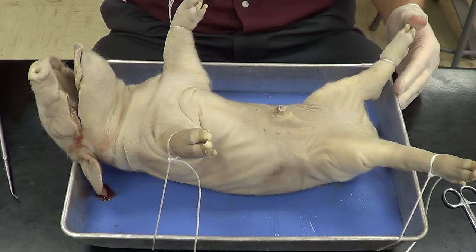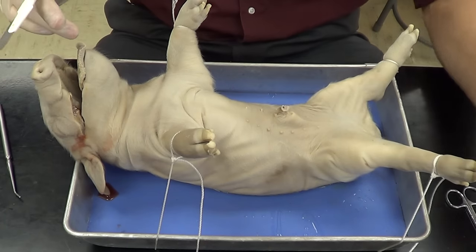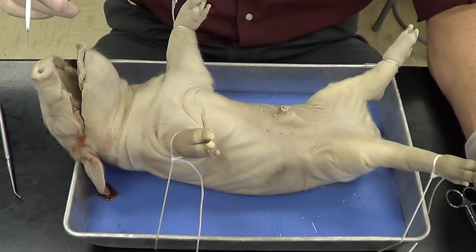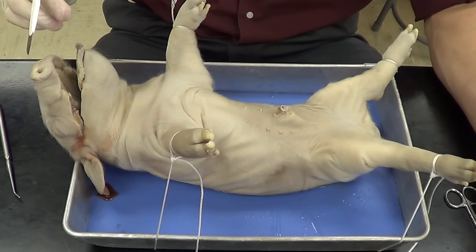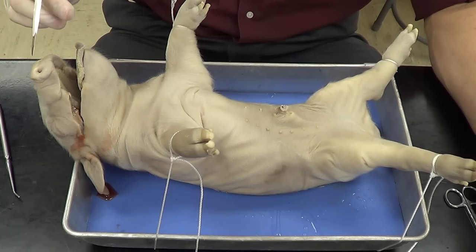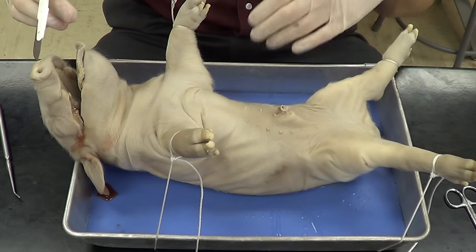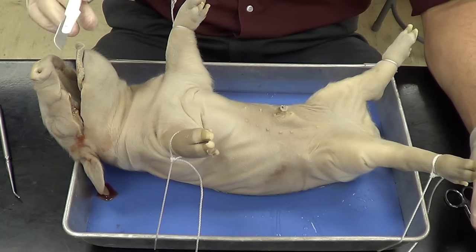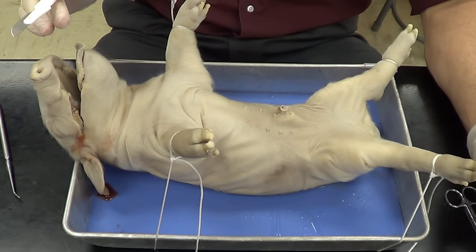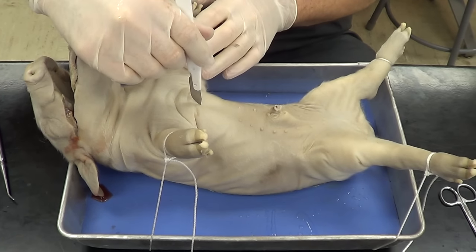Let's go ahead and get started. Hold the scalpel like a pencil. What's important here is not to go too deep. If you go too shallow, that's okay, because you can always cut a little bit deeper. But if you go too deep, you will cut through some of the vital organs that we want to take a look at, and some of these organs are going to leak fluids that will get in our way. Remember to keep your fingers out of the way.